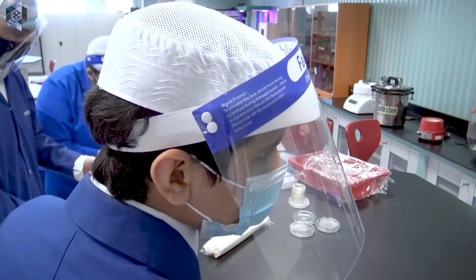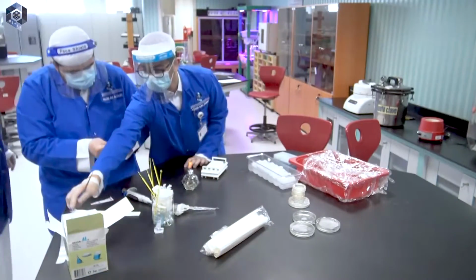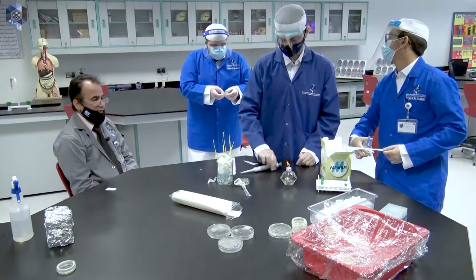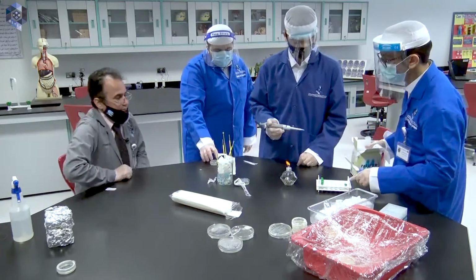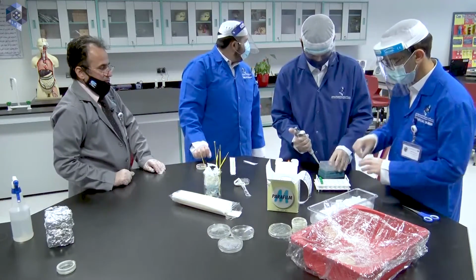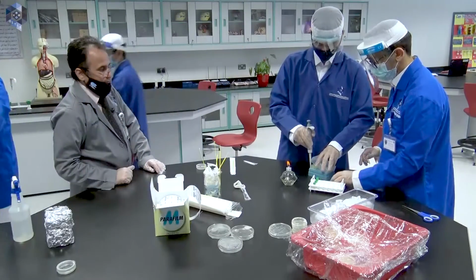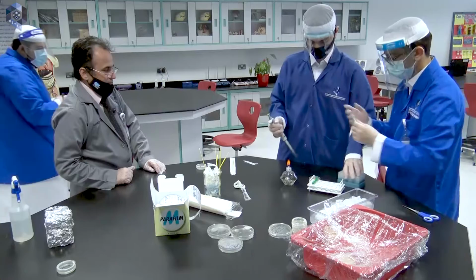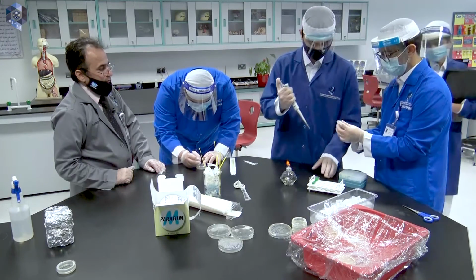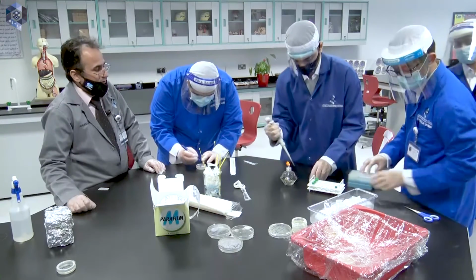Are you all done with this? Any one of them, they are all the same. Yellow tip, yellow tip, yellow tip. Mark the plate with your initials. Leave it for some time to settle on the bench. Then place it in the incubator.